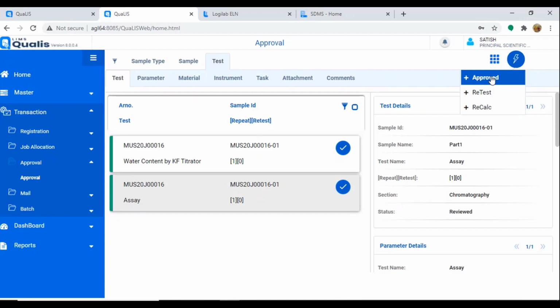A new one is created and then after the retesting, the final authority will decide what to do with the retest, whether to approve that also and say we conducted it twice and send all the results, or cancel the previous one and only report the last one. All options are available. Either they can cancel the old record, or they can send the old record also along with the new record. All are possible.